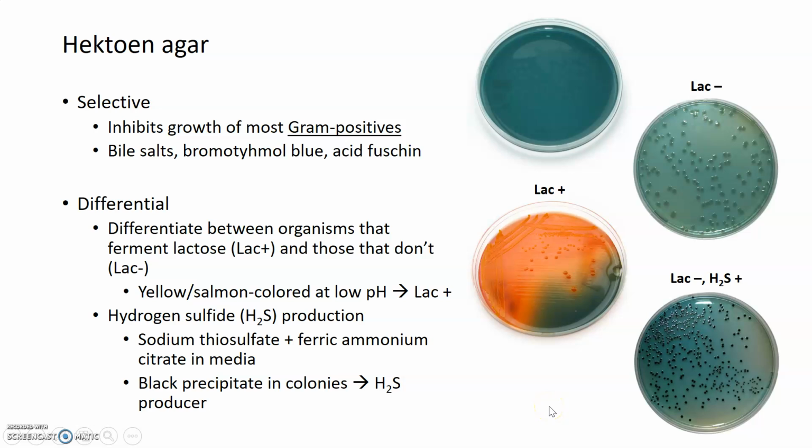And so Hektoen is interesting because it can differentiate not only between lactose fermenters and non-fermenters, but also hydrogen sulfide producers.